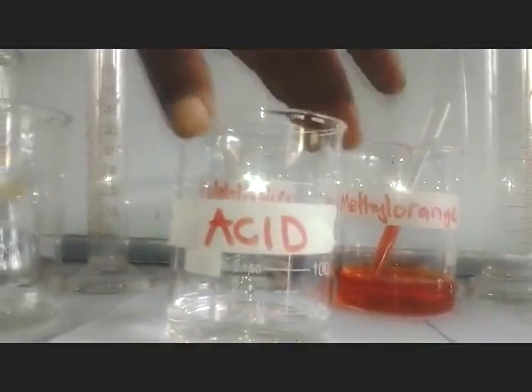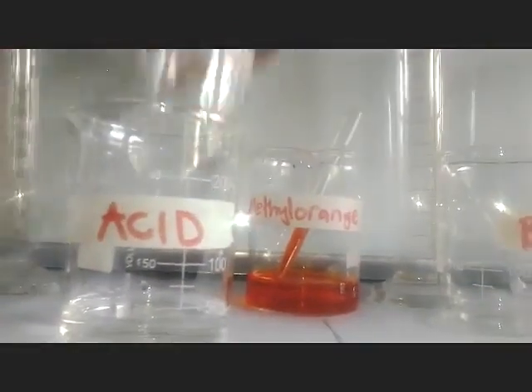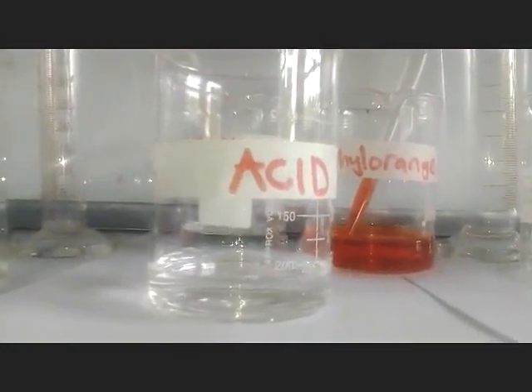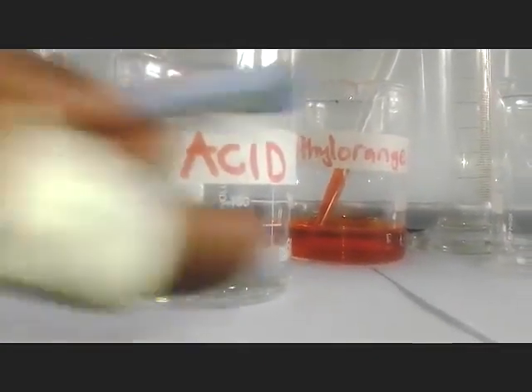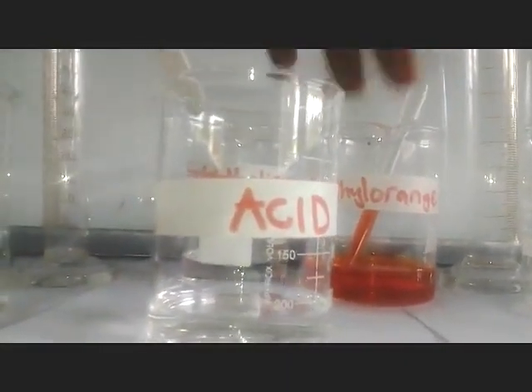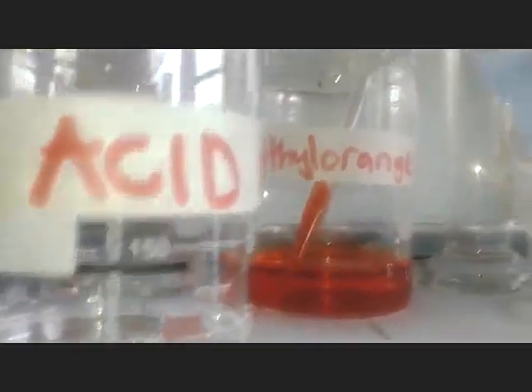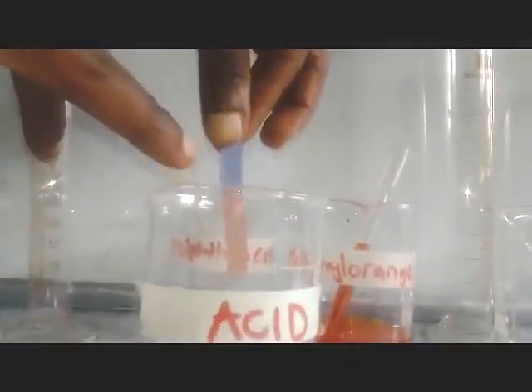Now, members, I want to show you how the phenolphthalein is behaving. Naturally, it is colorless, as you can see. Then we want to see its behavior in acidic medium. I'm saying this is an acid. The proof can be done by using litmus paper. Remember, litmus paper is also an indicator, but in the form of a paper. If I put the blue one in my acid, you can see that it is turning red. There's no magic behind this, it is only chemistry. So that implies that it is an acid.